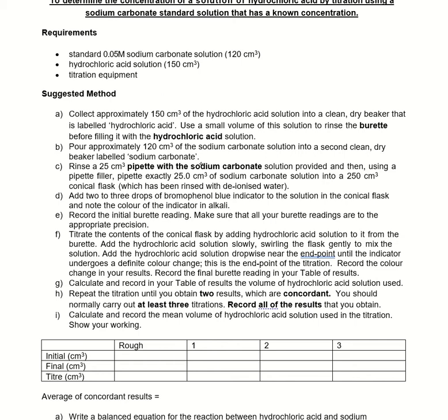So again, we're within the first assignment brief and it's a practical where we'll be trying to work out the sodium bicarbonate concentration within water. All tap water has these ions floating about within it. Generally, they don't do you any harm, part and parcel of flowing through pipes and things. So within this practical, the first thing we'll be doing is using some sodium carbonate to standardize our hydrochloric acid, and then we'll be reacting this hydrochloric acid, whose concentration we will have now worked out, to determine the amount of sodium hydrogen carbonate or sodium bicarbonate present.